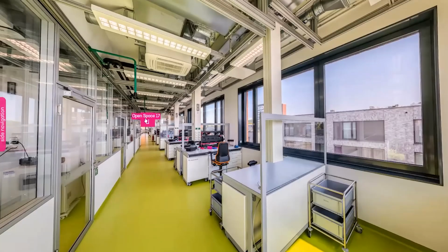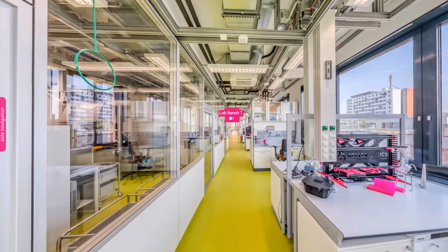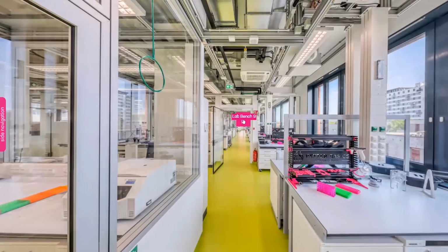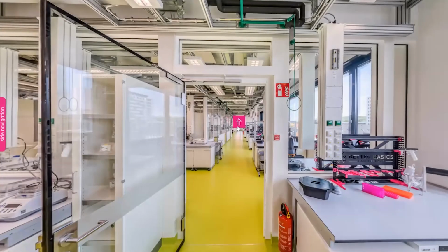And how do you handle chemicals? We take care of getting rid of the chemicals, and obviously the startups need to discuss with us, with our lab management, when they bring specific chemicals in. However, especially when it's critical chemicals, we only have small amounts, so that works well. And we have some chemical storage in the basement as well.